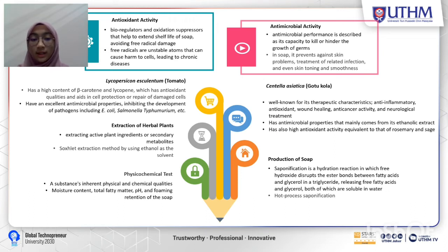And lastly is the physicochemical test. Physicochemical is actually the inherent physical and chemical qualities of a substance. For soap, the physicochemical properties include the moisture content, total fatty matter, pH, and also the foaming retention of the soap. These properties will determine the efficiency of the soap as a cleansing agent.